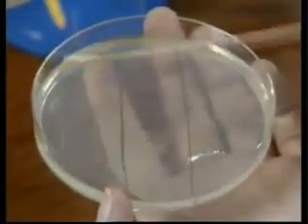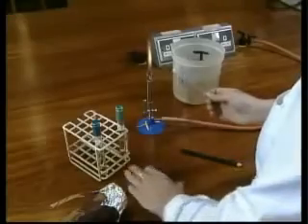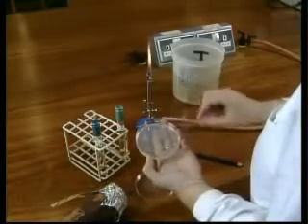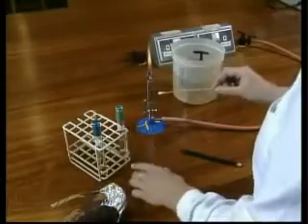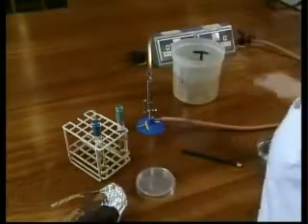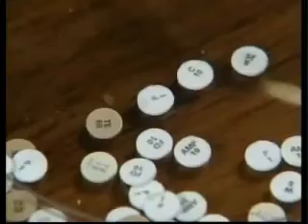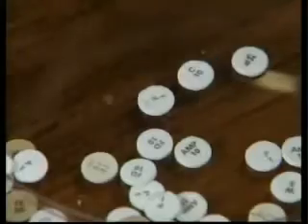The test strain is inoculated on both of the outer sections of the plate. After inoculating the plate with both the test and control strains, the next step is to apply the antibiotic discs to the culture.